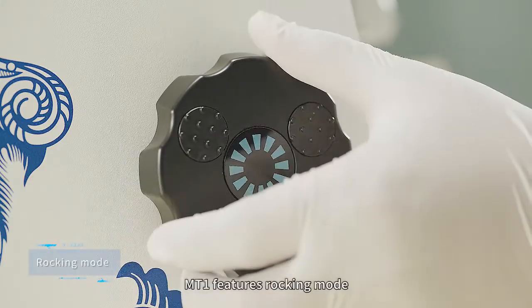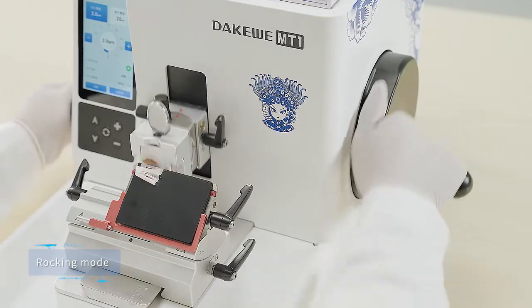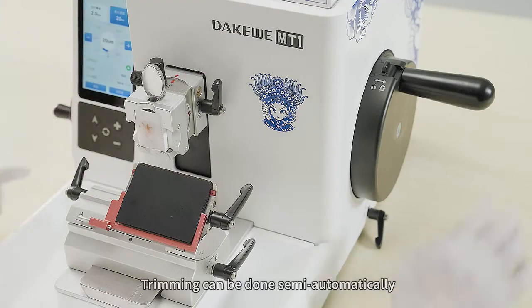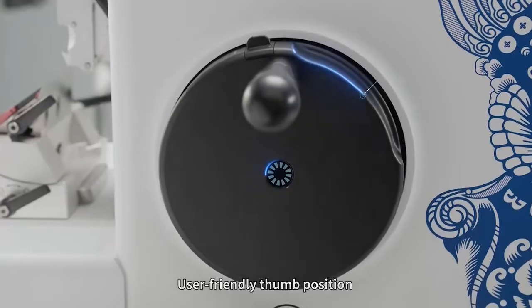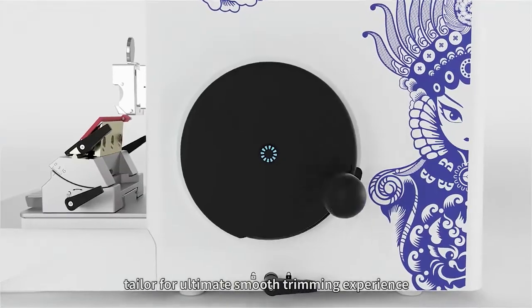The MT1 features a rocking mode where the operator can trim the block with only their right hand. Trimming can be done semi-automatically or manually using the coarse feed wheel, with a user-friendly thumb position tailored for the ultimate smooth trimming experience.